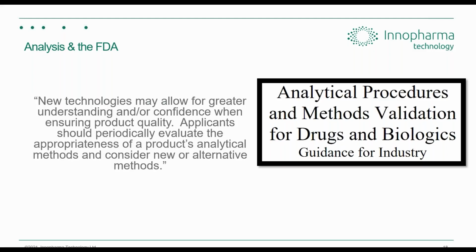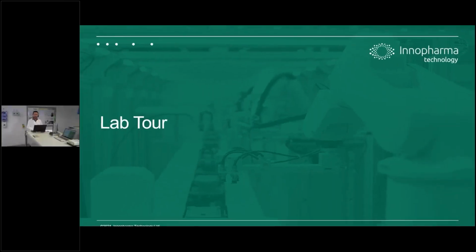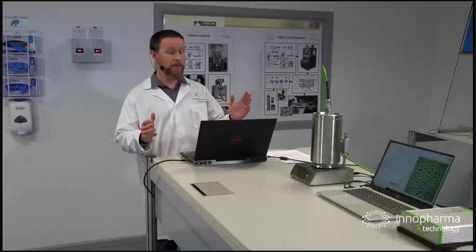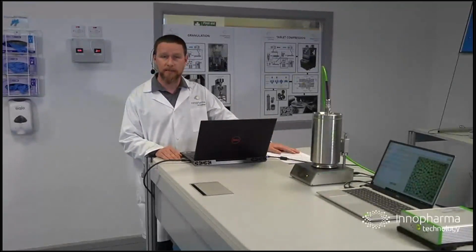Okay, so that was a real quick run through of essentially what are particles, how to measure particles, different methods of measuring particles, and why you might switch from one particle method to another, and how you might actually go about doing that with guidance from the FDA. Next, we're just going to switch over to a little bit of a lab tour here, showing some of this hardware. So I know Julie mentioned at the beginning, but welcome to our process lab here in Dublin, Ireland.